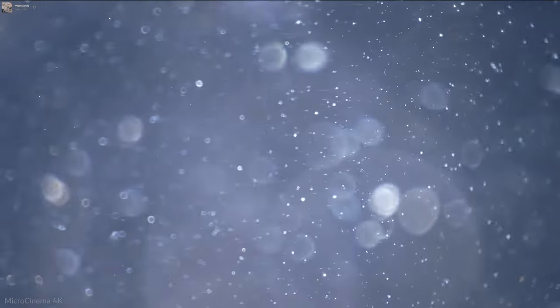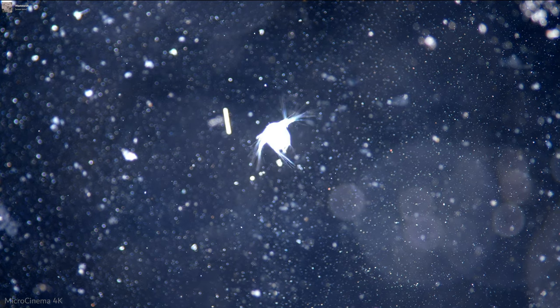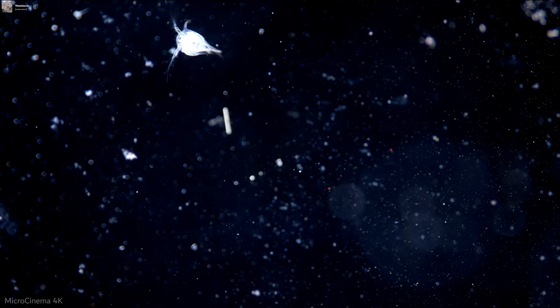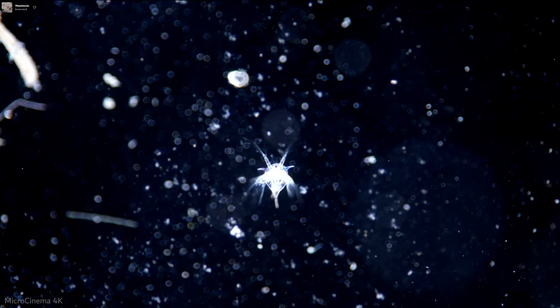We can try, we'll do dark field polarized. Let's first get our dark field going here and get our bad boy back in frame. Look at all that stuff. There you are. Ooh, look at all those frilly structures. Those weren't showing up before. Or maybe this is a different one than we were looking at, isn't it? I don't know.